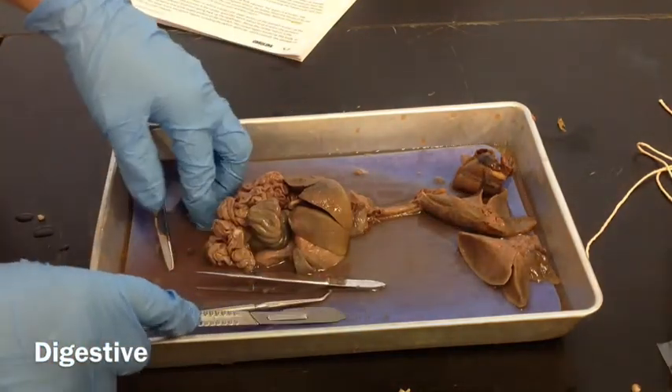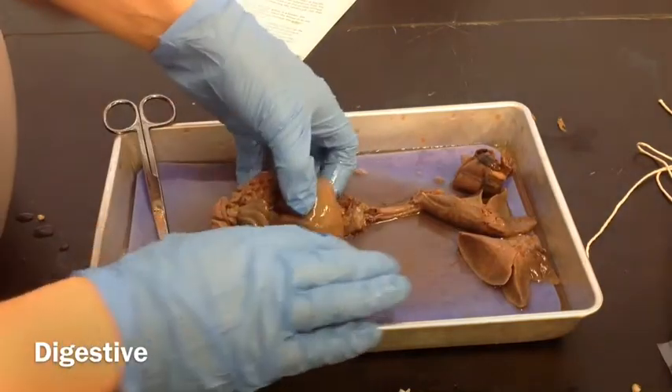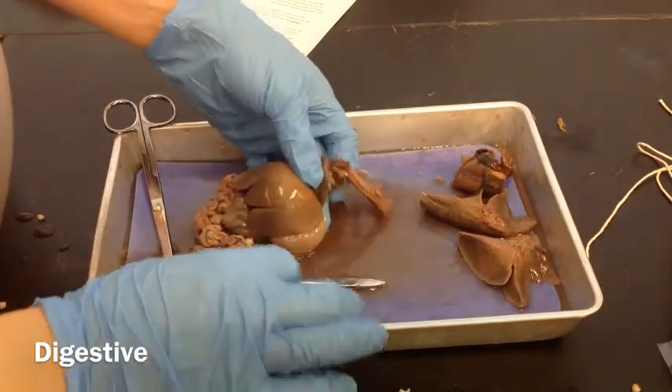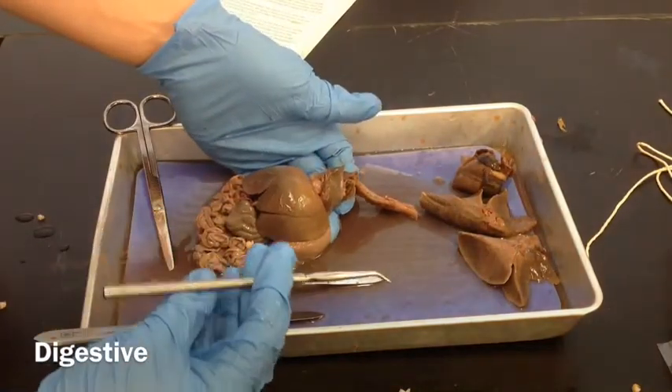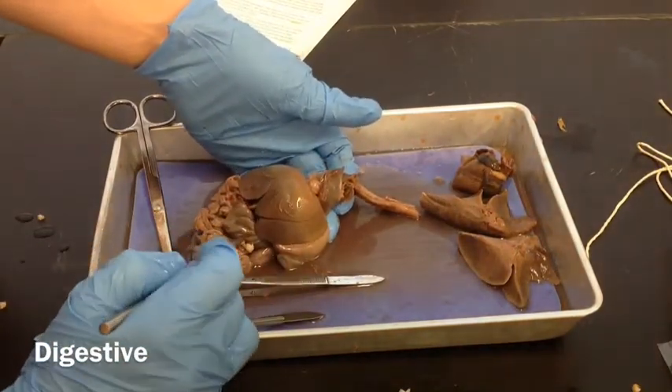Now we're going to look at the digestive system. This is part E of your dissection, and I'm just going to go through the parts first, and then we'll start looking at how to cut out the different organs for you to inspect.